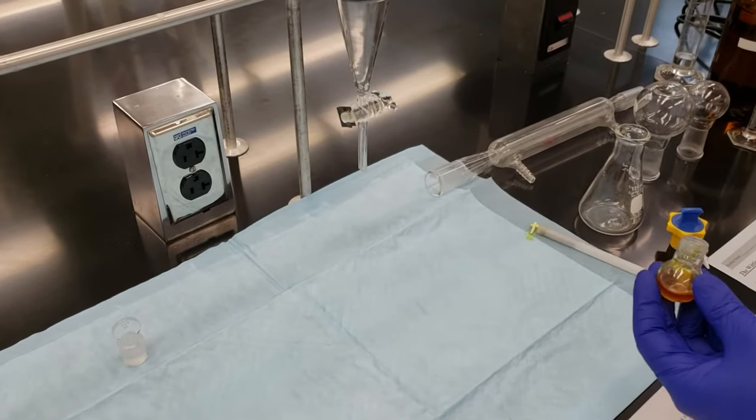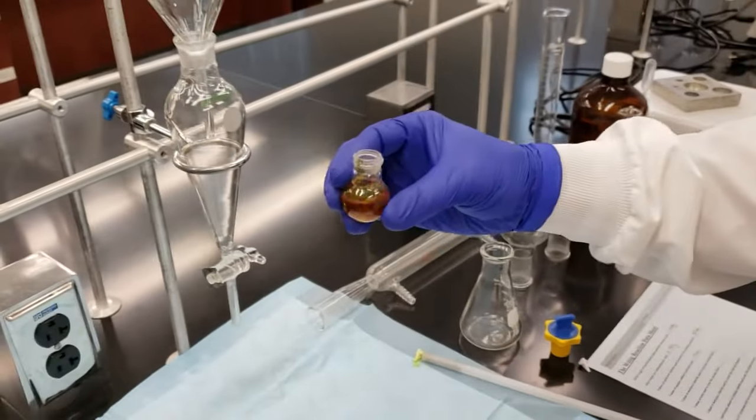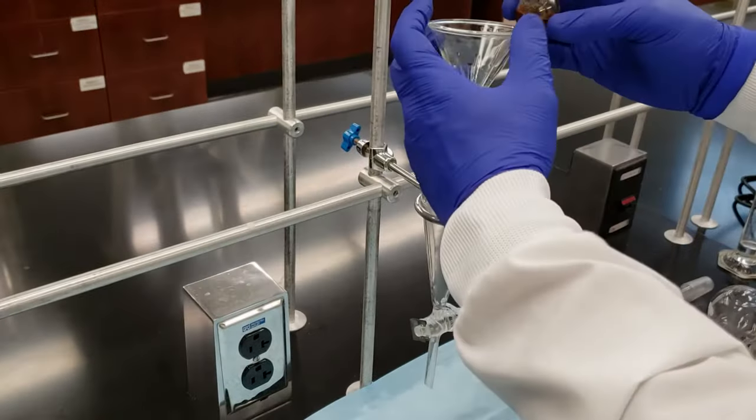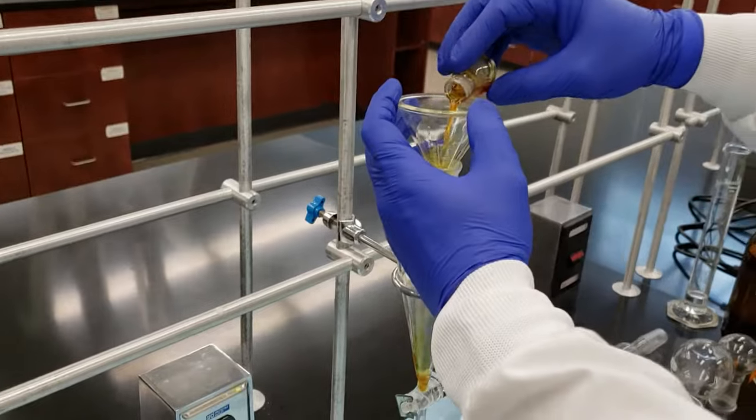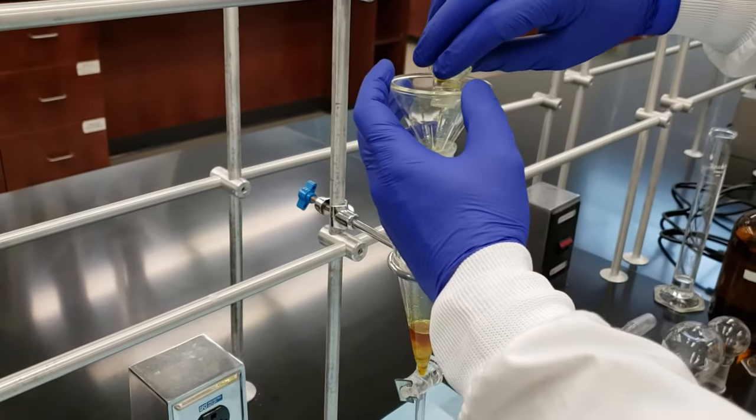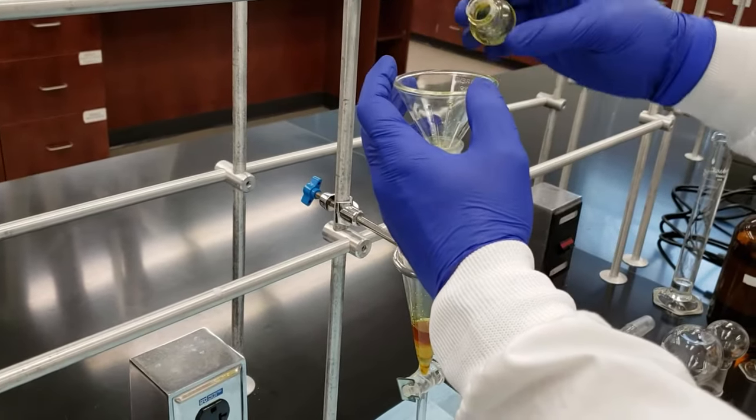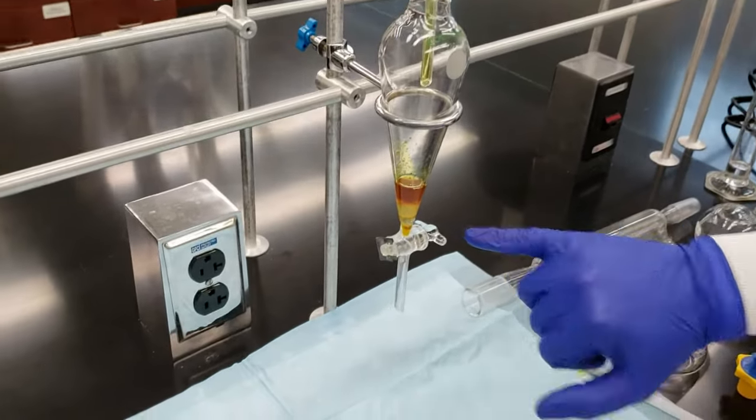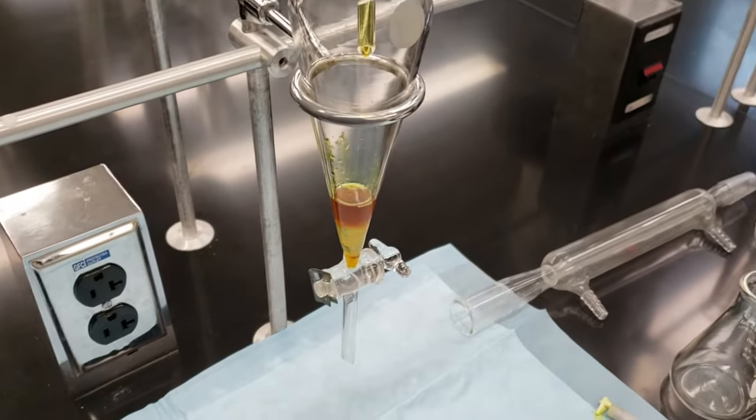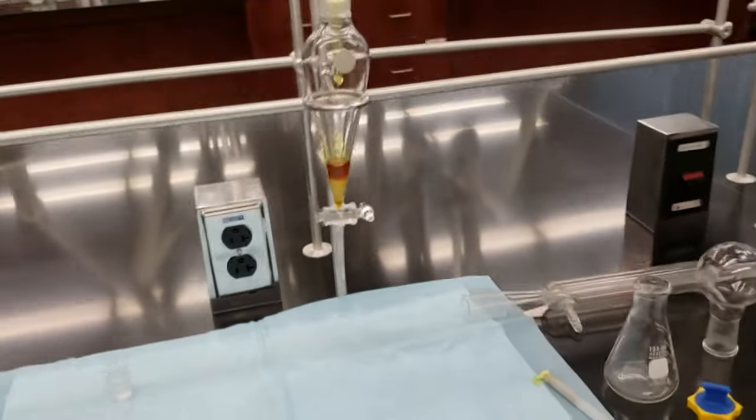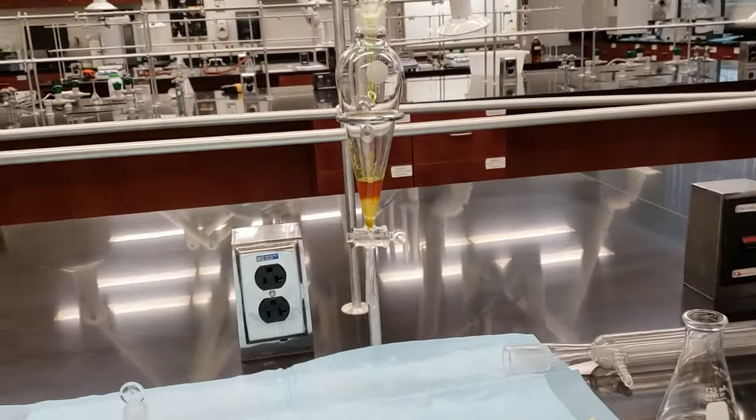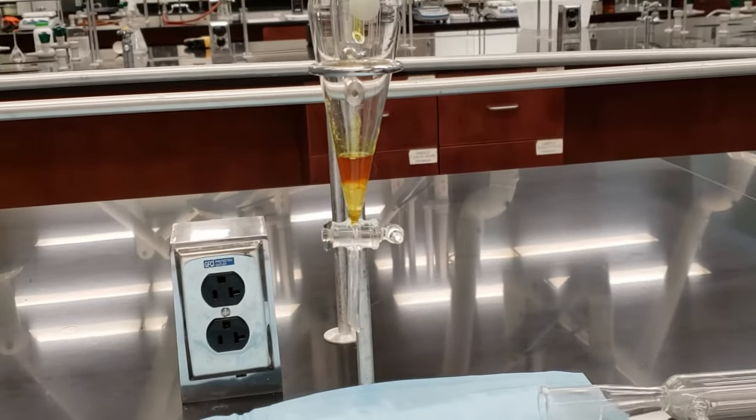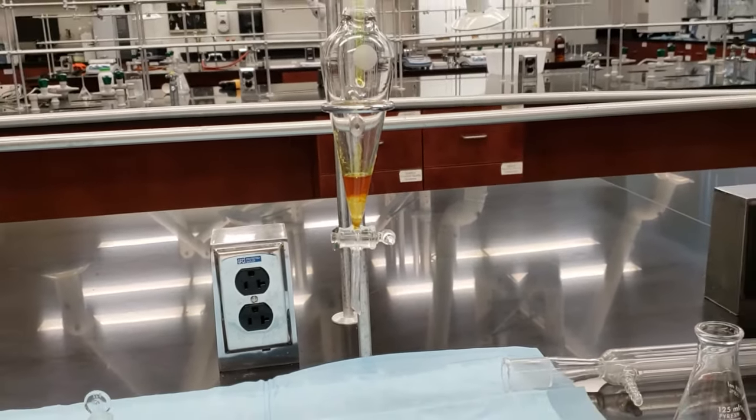And then we'll pour the contents of our reaction vessel into our separatory funnel. We've got to make sure that it's closed first. And we want to take a close look here. We see our layer separation. It's not perfect right now, but it's going to get a little bit better in a minute. So we've got our two layers. We're going to do two rinsings of our reaction vessel that will add to the volume of each one of those layers.